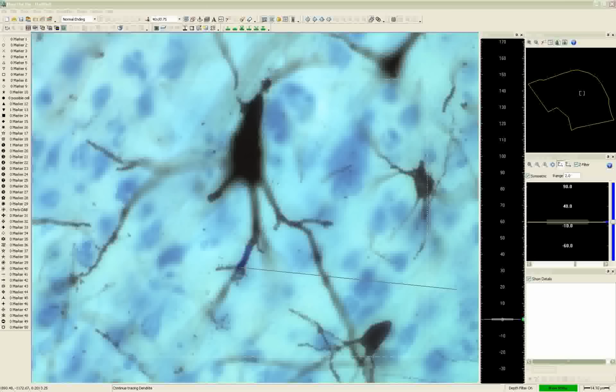And then I typically, when I trace my contour, I like to have the contour as well because that allows me to align the tracing grossly pretty easily at a low power. It's pretty difficult to think about aligning the tracing of a neuron that you'd like to resume at low power. You typically have to be at a higher power. So I place the reference point and have that contour that I trace also as a reference. I make a fiducial portion of the contour extremely accurate so that I can quickly align.